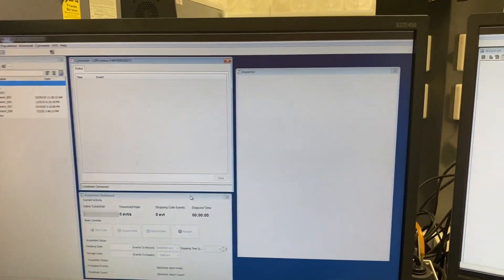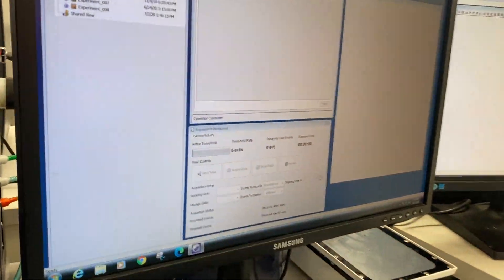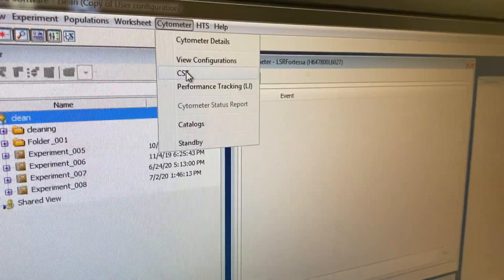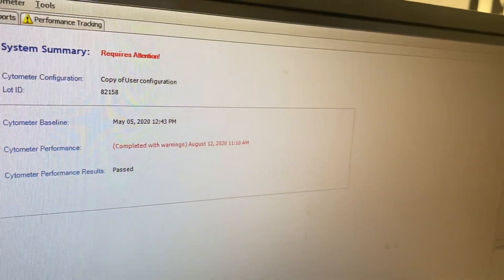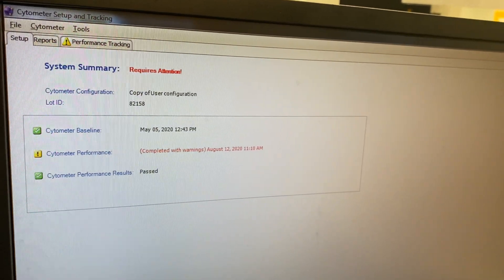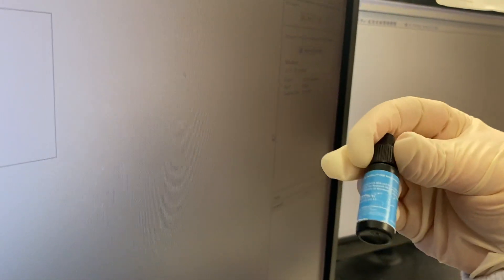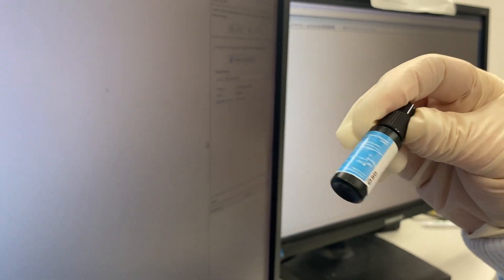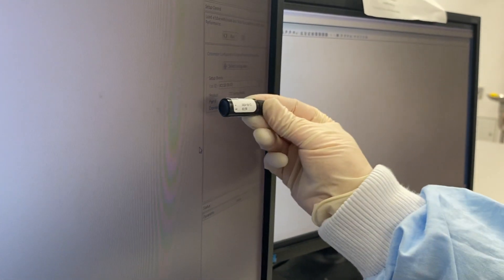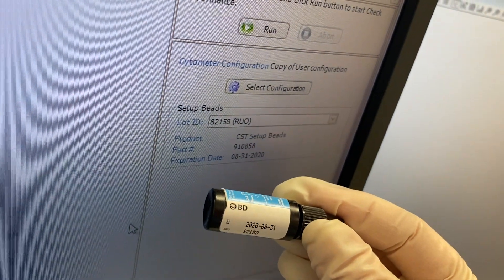Once it has connected, go to Cytometer and click CST. That will make sure that you log out of Diva and into the Cytometer Setup and Tracking. You will run the blue beads — this is for the two Fortessas and you can find them in the fridge where the rest of the bottles are. Make sure you check the lot ID number: 82158 matches 82158, so you run the right CST beads.